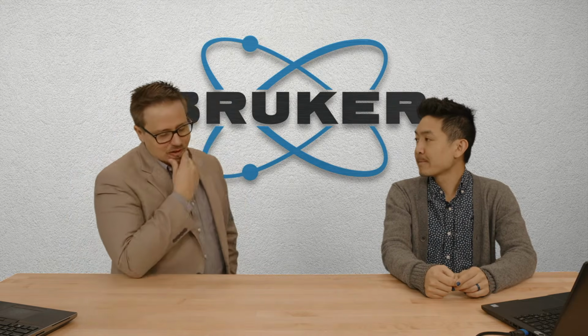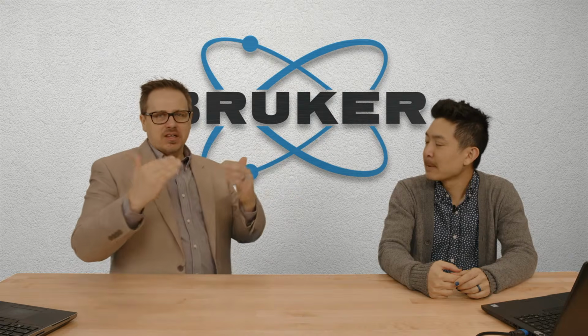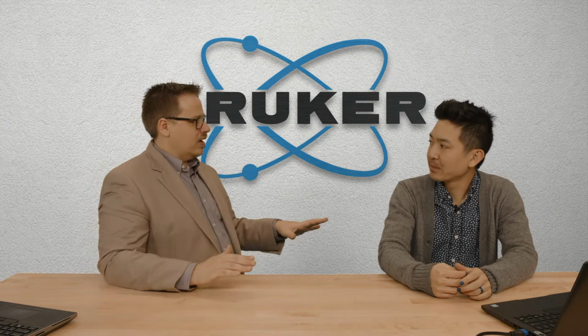But I guess the way I've done it, and maybe you can say if it's completely off base, is if I look at the peaks, and they're lining up with the patterns, it looks like a good powder pattern, and the peaks are about the same width. Then you don't have this situation with a really soft material and a really hard one. If you got that, then when you grind it, you're going to have totally different peak widths, and that's going to screw up that RIR method, right?